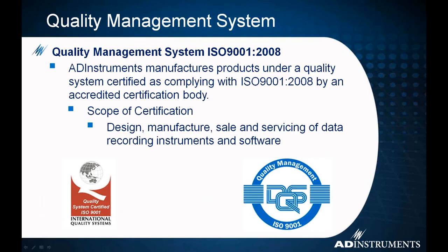So if you have an ethics review board situation, or some of your labs say, well, we want some sort of certificate saying that this is an accurate piece of equipment, we can provide you with the quality management system certification we have. This is also available on our website. So it definitely allows you to provide that guarantee if you require some sort of laboratory review.